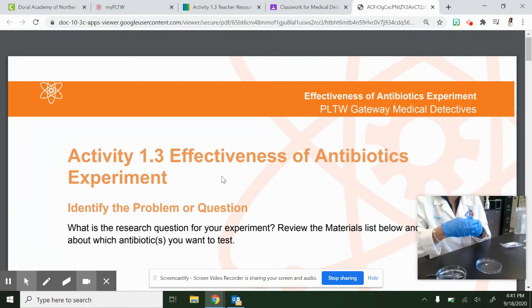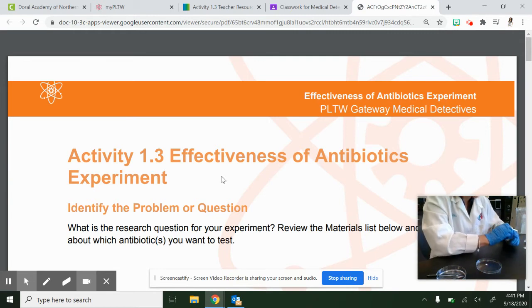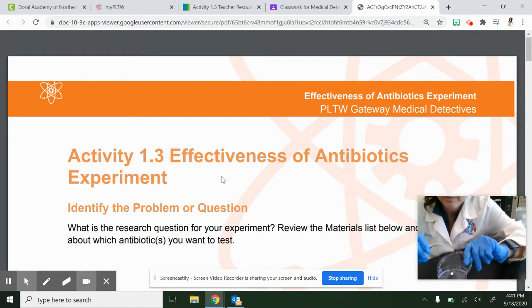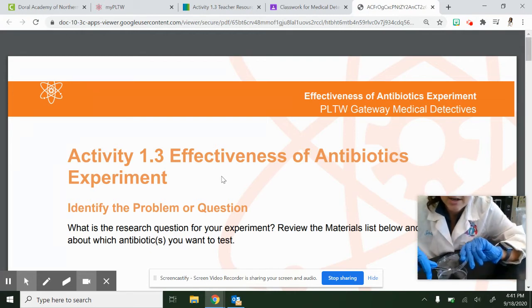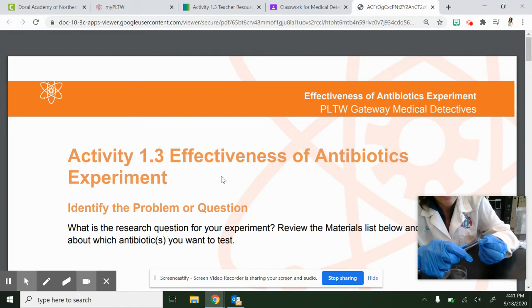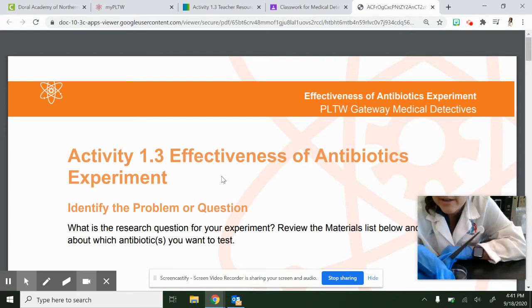All right, so here we go. Here, I got a disc for you so you can see this. Okay, so this disc has nothing on it. So, okay, see, it's just, oh, geez. I was flipping across the table here. Okay, there we go. Now you can see the disc. So that's how tiny they are.